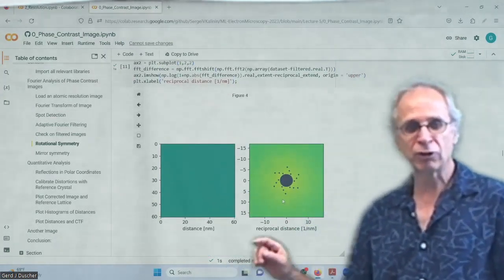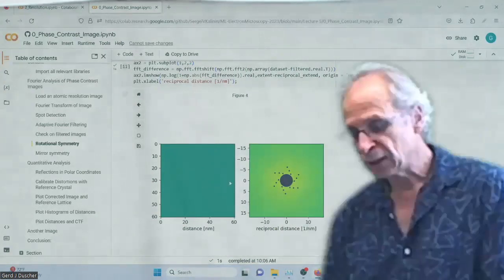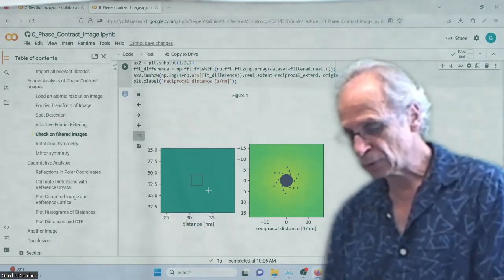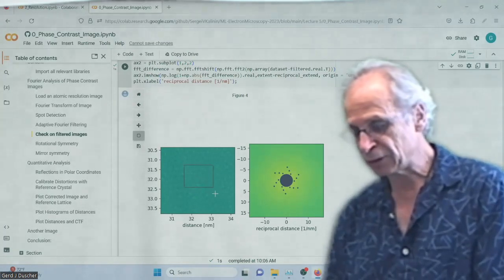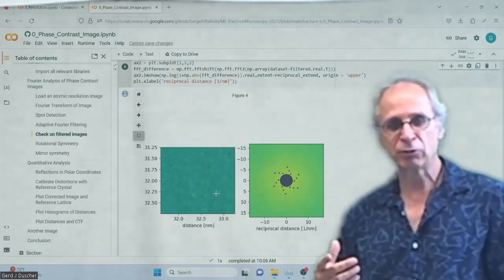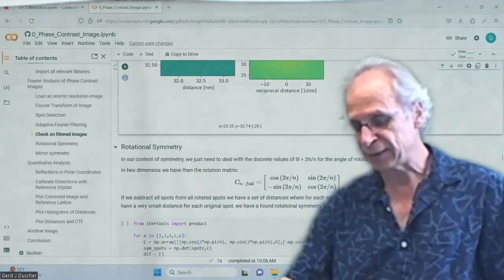And of course, in order for us to be sane, we want to see what we did. Okay, we did Fourier filtering here. And did we miss any kind of information? You have to zoom in quite a bit before we see something. Okay, the only thing left is high frequency noise in these images, right? So that's good. No information was lost. We got all the information. And so now we analyze it.